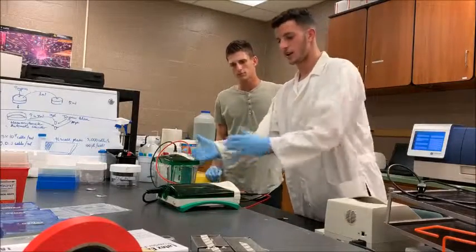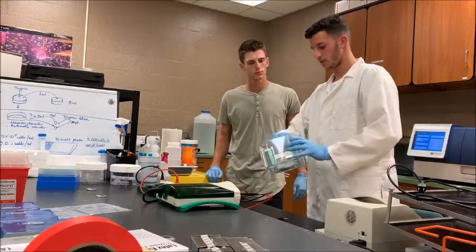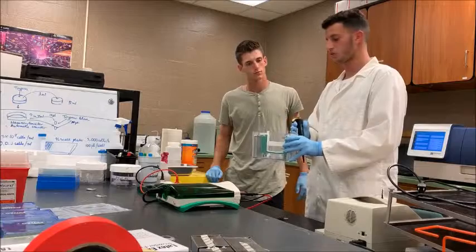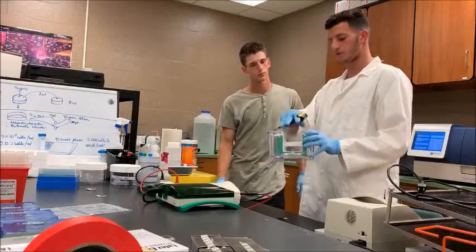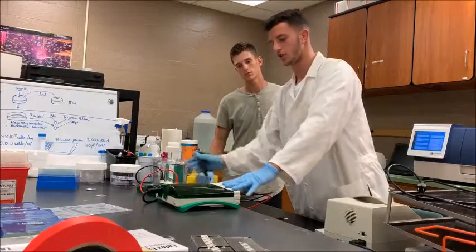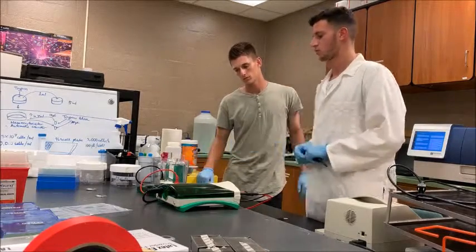Okay, so this is the gel electrophoresis machine, and here is where you're going to be placing your gel, and it's going to be standing here in a vertical position. The gel will contain little wells in which you will load your solution, your fraction containing the specific solution with the Laemmli dye. And once it's loaded, you'll go for the next step. You will add a specific buffer with ions that will help to conduct the current from negative to positive. And you will plug in the machine, which with a specific voltage will run for a specific amount of minutes from negative to positive, as you said, and will differentiate the solution by size.